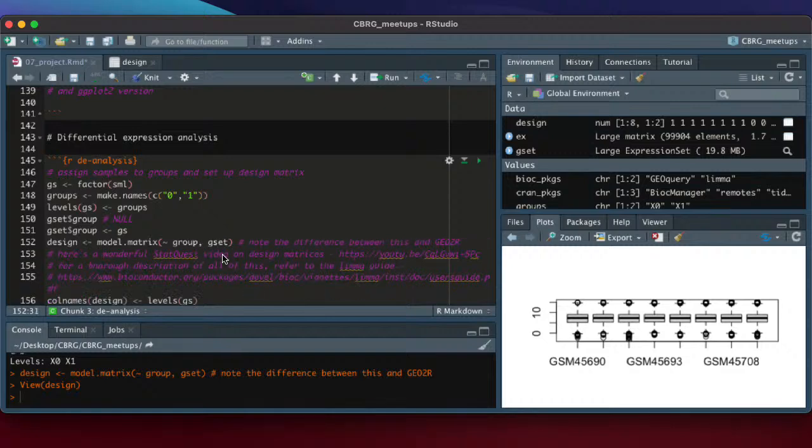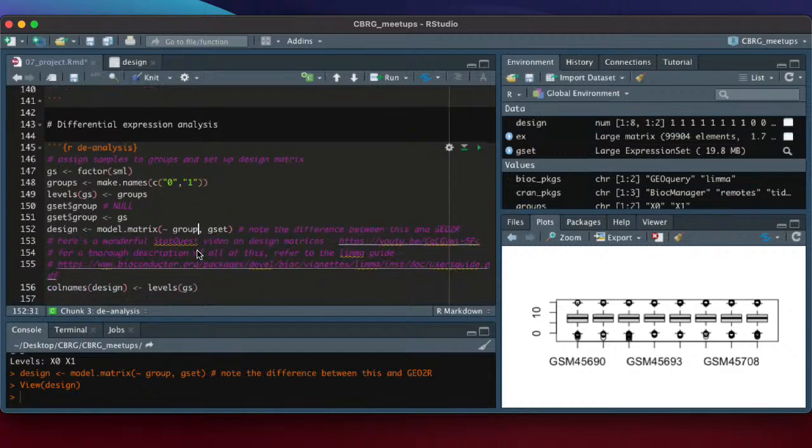All right, so we have a design matrix, and I wanted to say design matrices can get a little tricky. Even this is the simplest case, but for more complex cases, by definition, it becomes more complex.